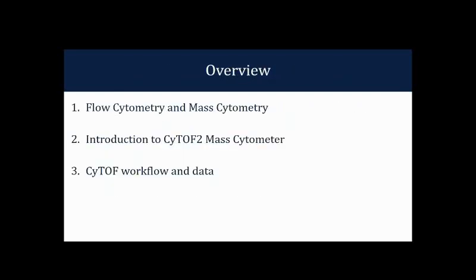So that said, I want to give a brief overview of what my talk today will cover. I'll start with a comparison between flow cytometry and mass cytometry. I'll then lead that into an introduction to our CyTOF 2 mass cytometer, and then give a general overview of the workflow and data analysis that comes with running a CyTOF experiment.